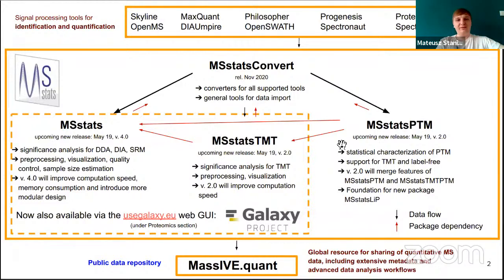I will talk about the whole ecosystem of packages built on top of MSstats. So yesterday's session introduced the concepts that are behind the MSstats package. Now there are other packages that cover other experimental workflows, like today's session is dedicated to MSstatsTMT. We have also MSstatsPTM and other packages in the works.